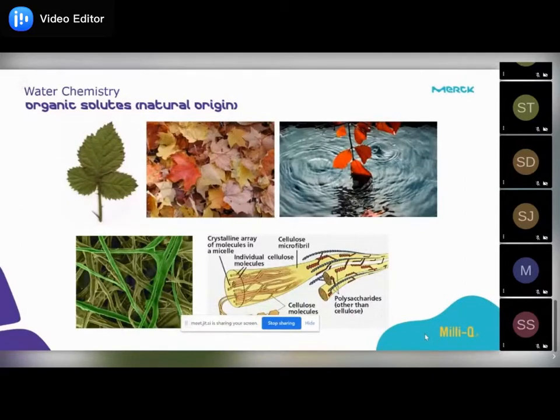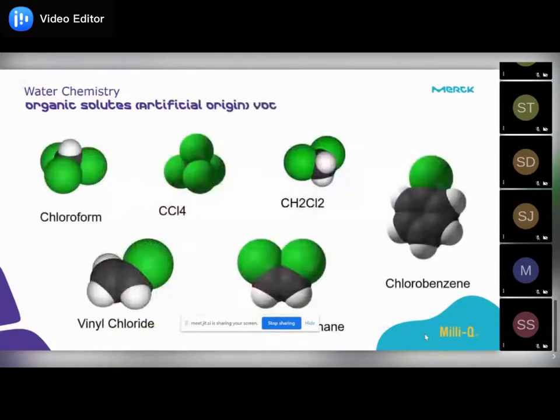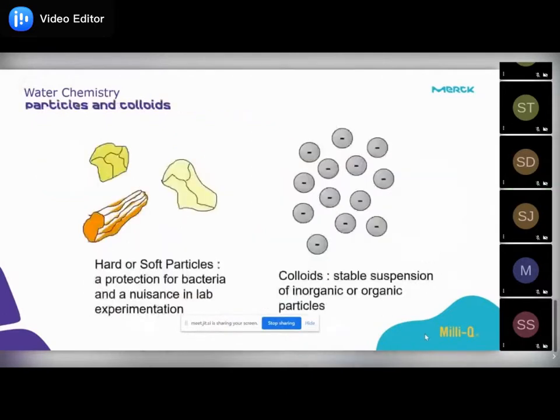And what are those contaminations exactly? This is majorly in terms of organics. It could be various other things. And volatile organics are also very much present in the air, so this may also create a lot of problems in our water. Similarly, particles, which start from dust particles, mud particles, if anything is present. This is not at all something we are looking for whenever we are working on any kind of application in the laboratory.